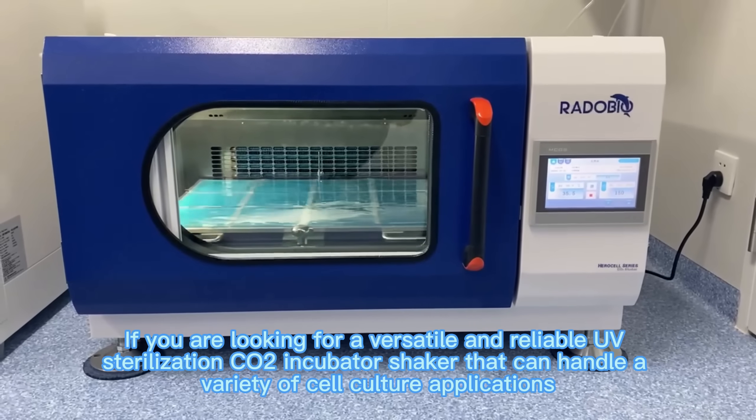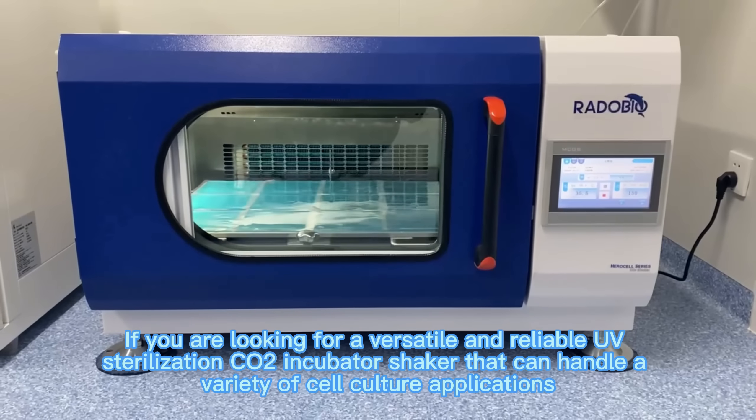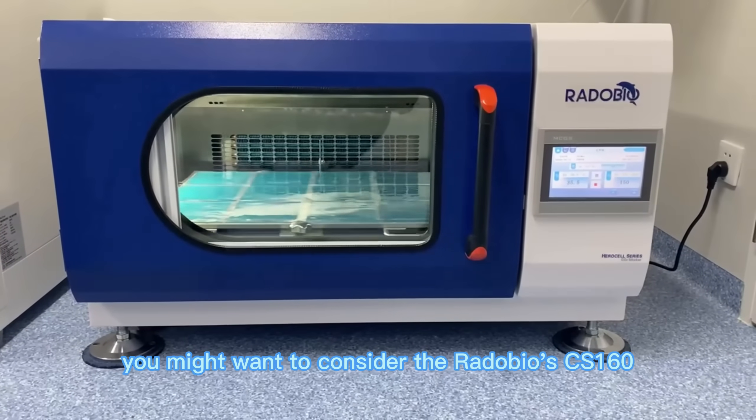If you are looking for a versatile and reliable UV Sterilization CO2 Incubator Shaker that can handle a variety of cell culture applications, you might want to consider the Radobio CS160.